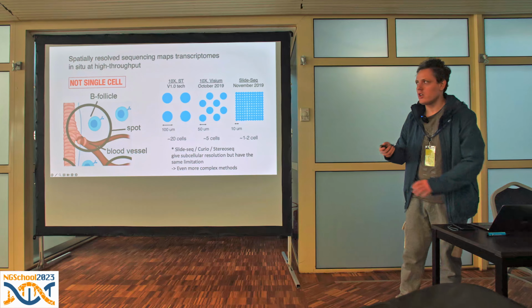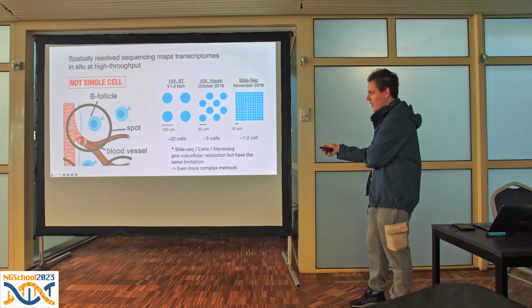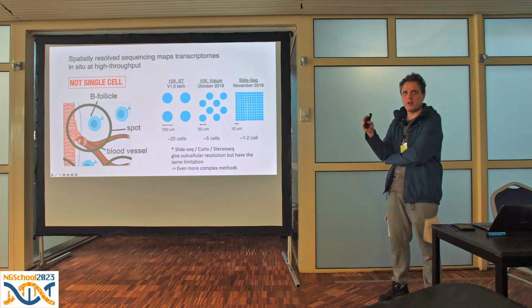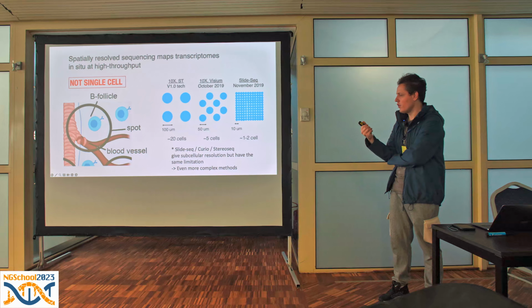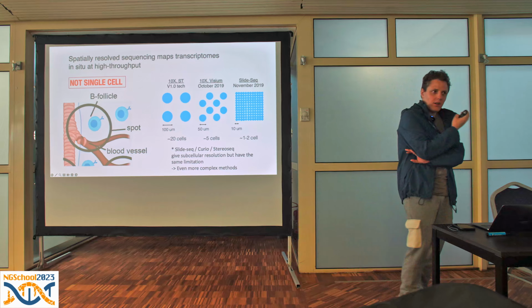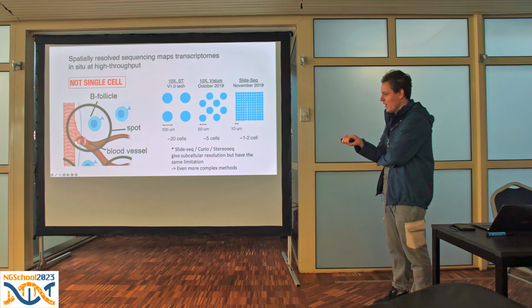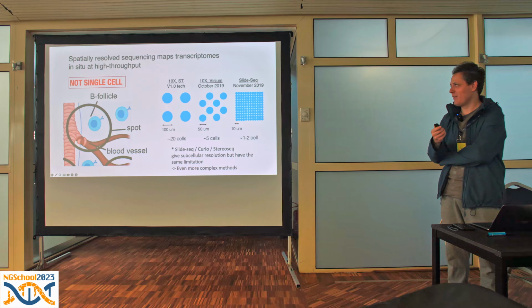One of the major limitations of these technologies is that they are not single cell. There has been a dramatic improvement. This slide is a bit old, but a lot of proof of concept papers came around 2019. However, actually commercializing technologies and making them work in practice took quite a long time. For example, Slide-seq was published back then, but it's only now getting commercialized as Curio and offered to researchers for easier use. And generally, until these technologies are commercialized, the only labs who can do them are the labs that developed them, or the people who worked in the labs that developed the technology.